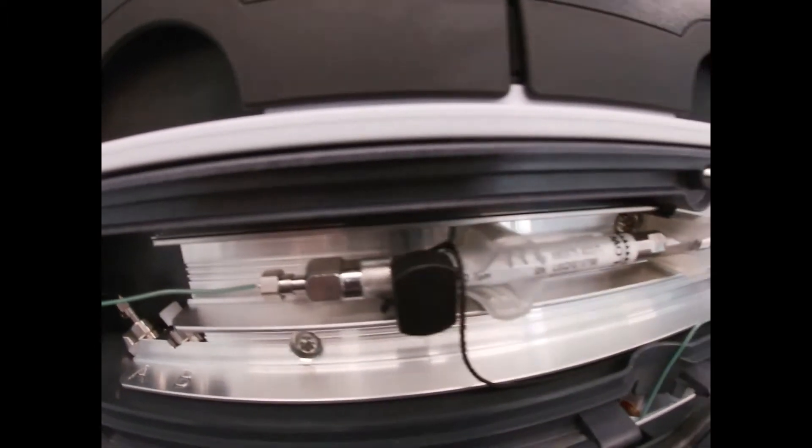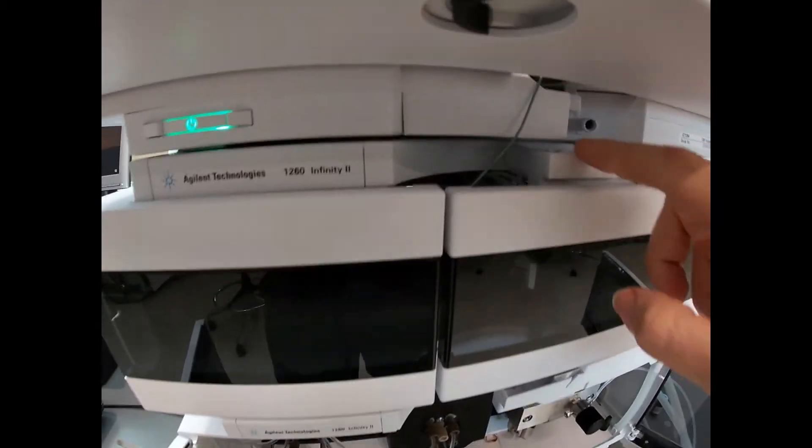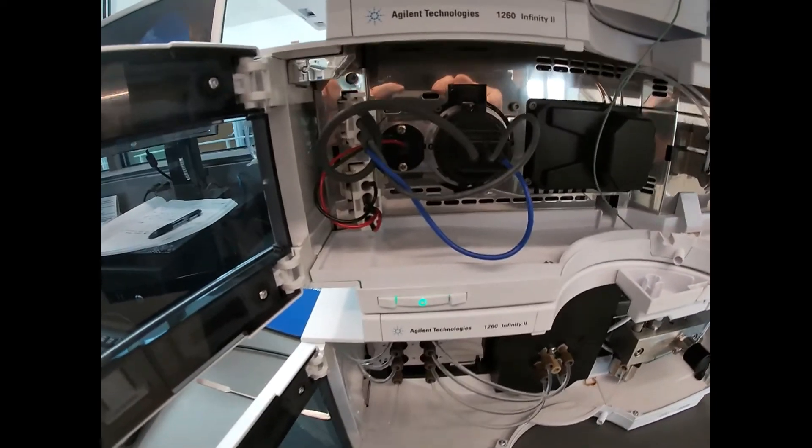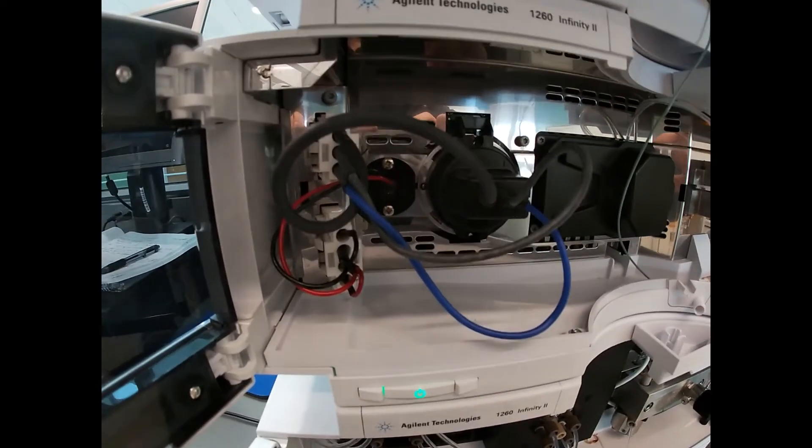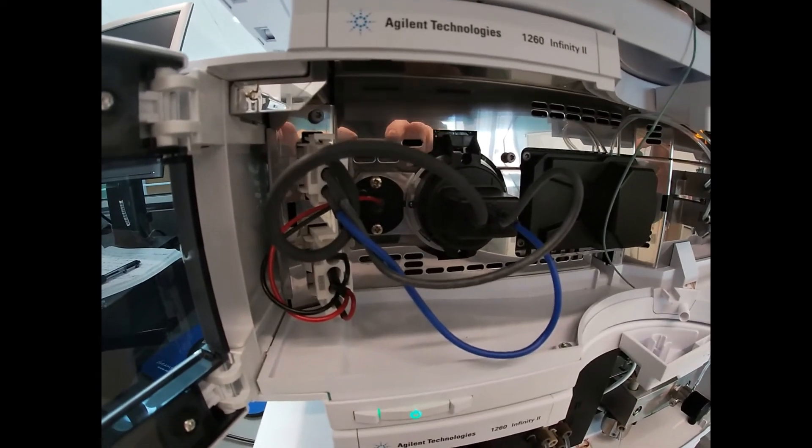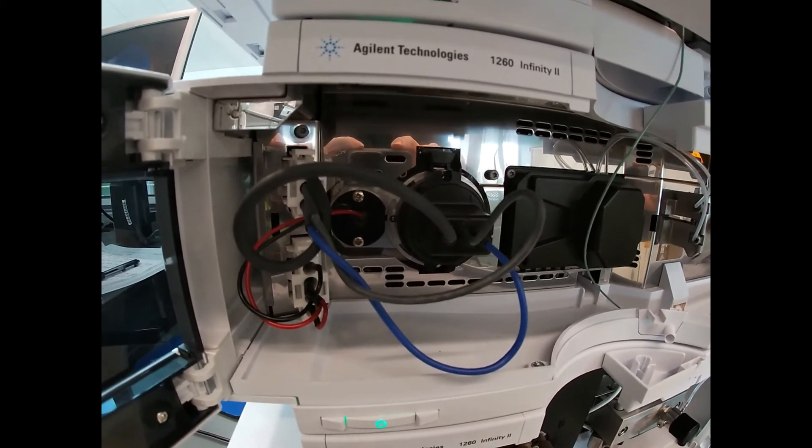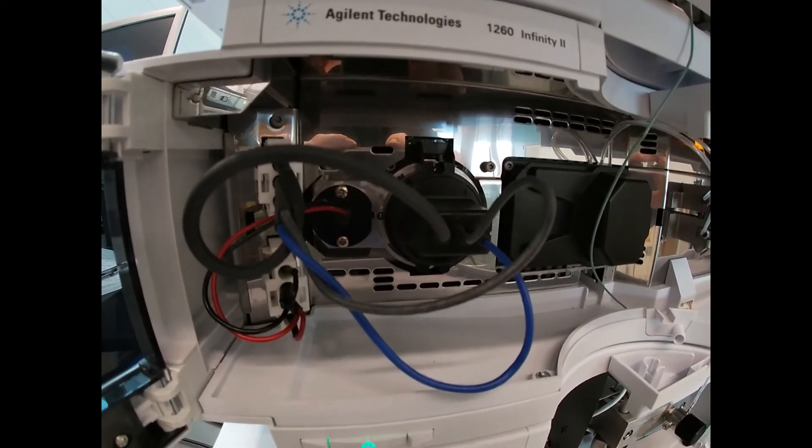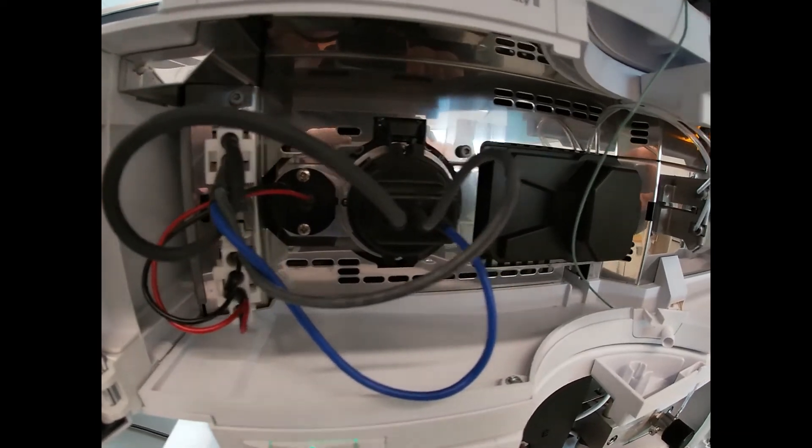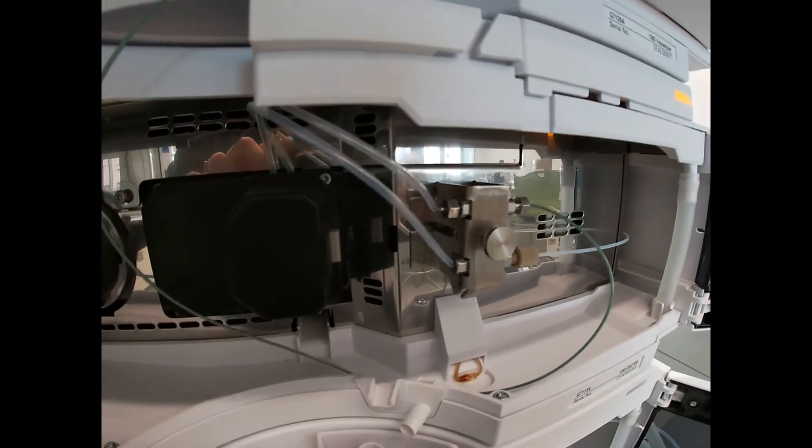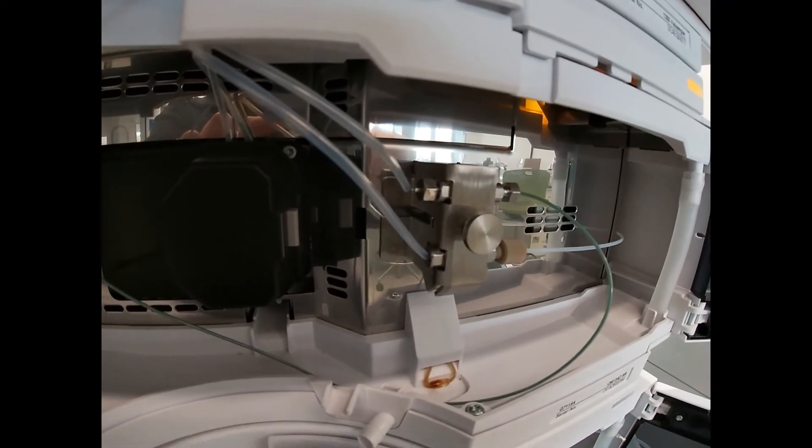Then we pass down to our next compartment where we have our UV source. We have a deuterium lamp and a tungsten lamp that provide UV and visible light or electromagnetic radiation. We have a flow through cell where we pass the light through our sample and detect absorbance.